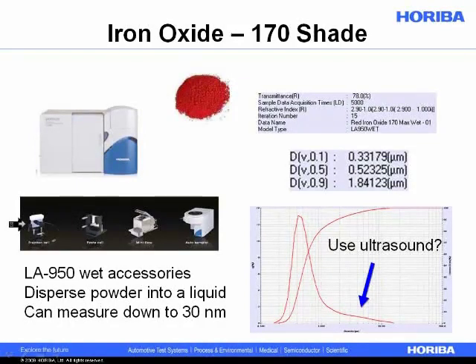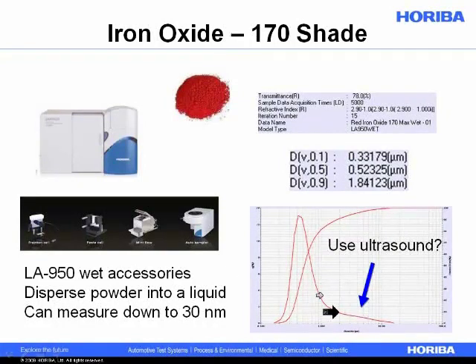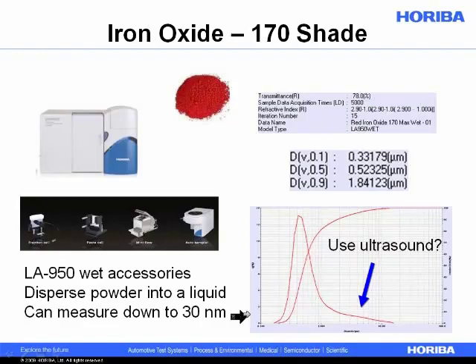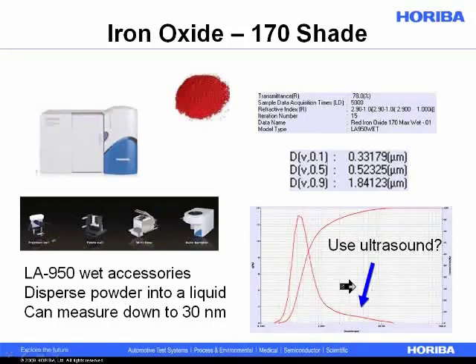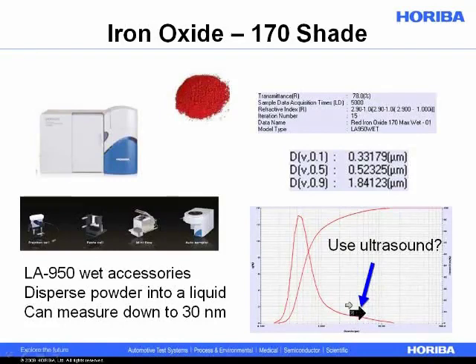One of the other reasons we might use a wet dispersion for this powder is that looking at the results, we see larger particles and then the main peak, possibly indicating agglomeration. We might want to use ultrasound to break up these agglomerates. However, although often the goal is to measure the particle in its primary state, we decided not to use ultrasound here because what we're really interested in is the natural state of the powder as we use it — since the absorption characteristics of color are dependent on size range, and as you apply it, you're not going to use ultrasound.